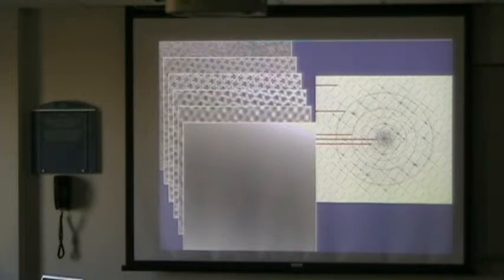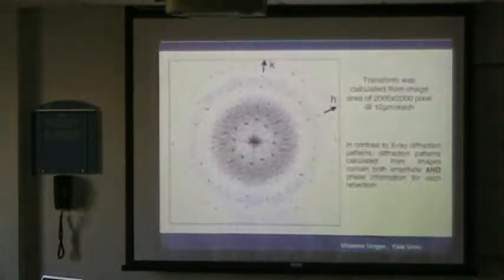Now that was a negative stain crystal, and in this case we actually have, as I said, a lot of contrast. We can focus in a relatively close to focus way. What that means is the following. When I go to an ice crystal, I have to defocus a bit to generate contrast. And what you have not seen in the other diffraction pattern, but what you see here is now these empty rings, or these so-called Thon rings. So we have information here, and then we lose information, and then we have information again, but we have a phase shift. We have 180 degrees, sorry.